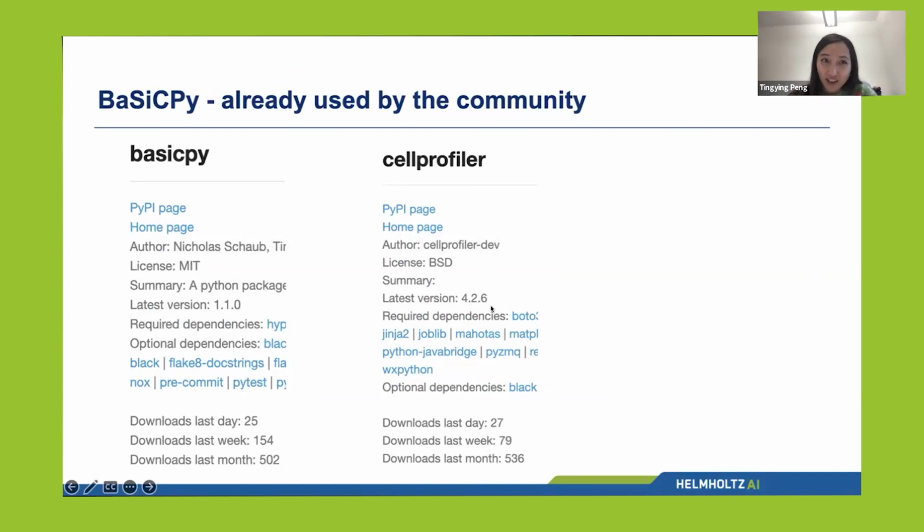And you understand, behind CellProfiler is basically a team. And behind BaSiC, we have our main developer, Yasuki, who is a very bright Japanese postdoc who works at the Nikon Institute in Japan. It's basically him and me, two people, and I don't mainly do coding, I answer questions. Sometimes there are special questions about parameters and whether it works or not, but all the coding is by Yasuki himself. Even with that, we achieve similar downloads as CellProfiler, so we are quite happy and also proud of ourselves.